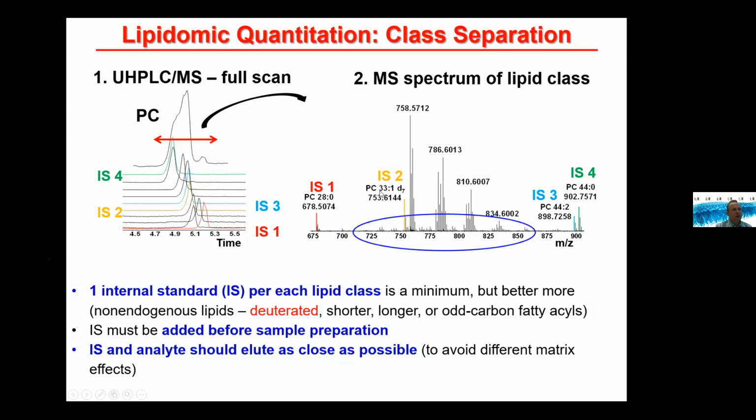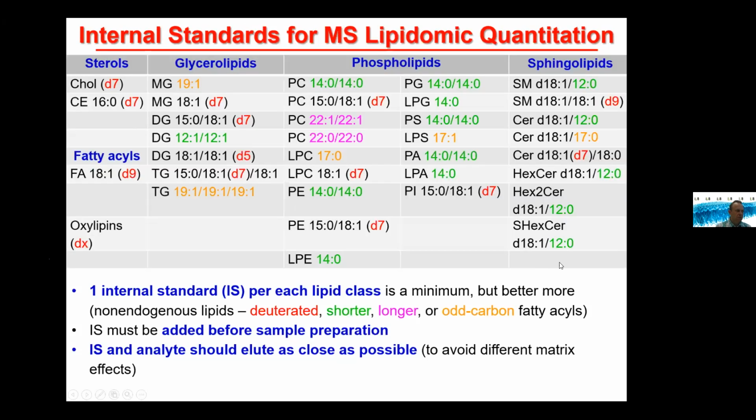This way you are able to calculate the quantitative error of your determination, and then you will be definitely much more confident with your quantitative data. You may also avoid some possible mass interference if you use just a low resolution analyzer, or if you have some hidden problem. This way you will easily discover this problem.